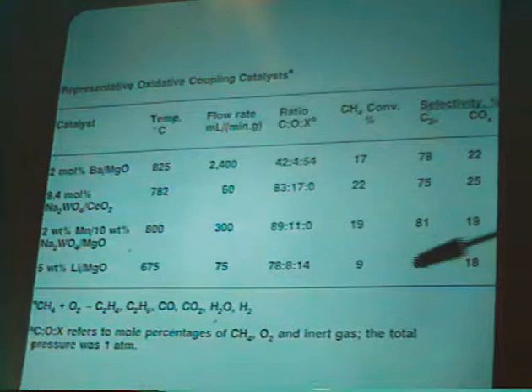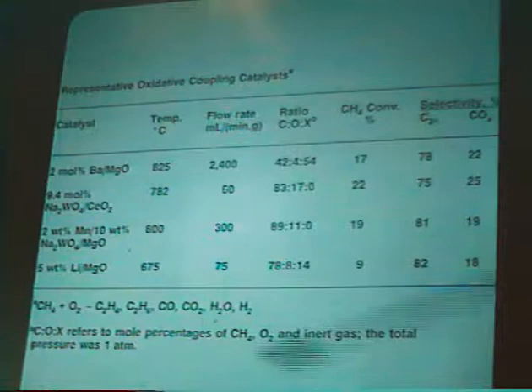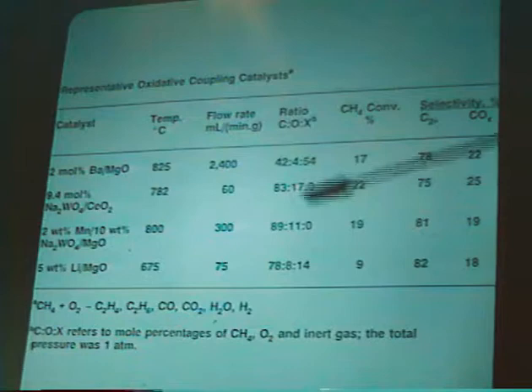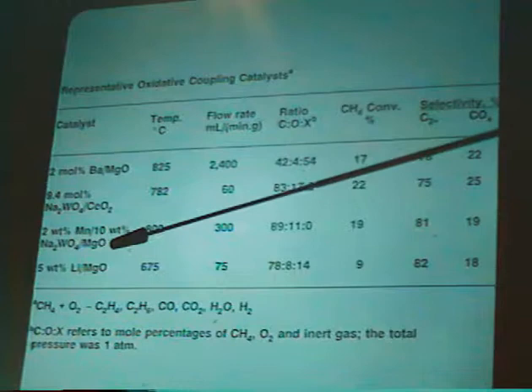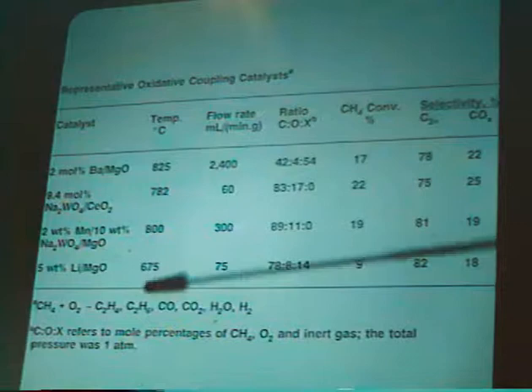Another catalyst, which is somewhat related to the ARCO catalyst that was introduced about a decade or so ago, involves manganese, magnesium oxide, and as well sodium tungstate. And we'll be making some comments on that and talking about the Raman spectra of that. And then finally, our old friend, the lithium mag oxide catalyst.